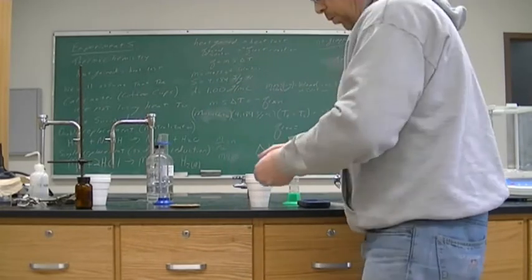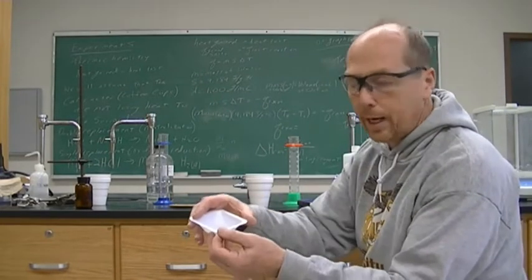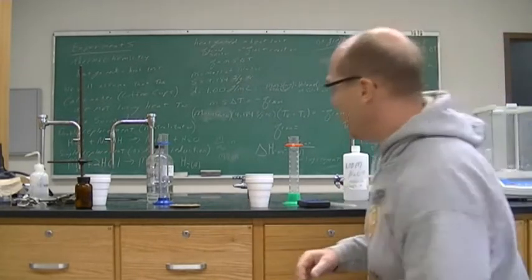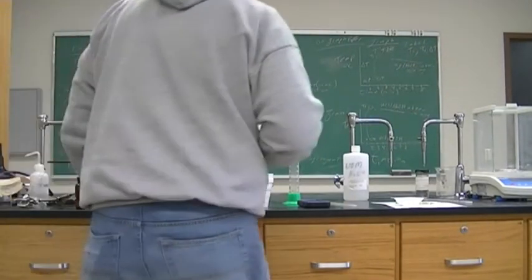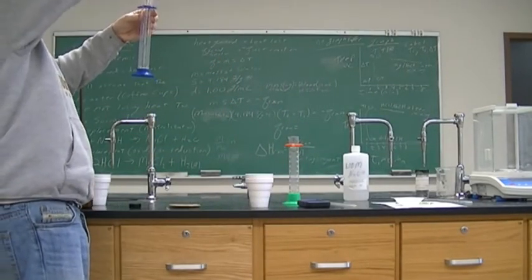All right, and so it says between 0.2 and 0.3, so I have weighed out 0.2658 grams. So 0.2658 grams of magnesium have been measured. I have not gotten my HCl yet. The HCl, it says about 70 mils of HCl is to be added.